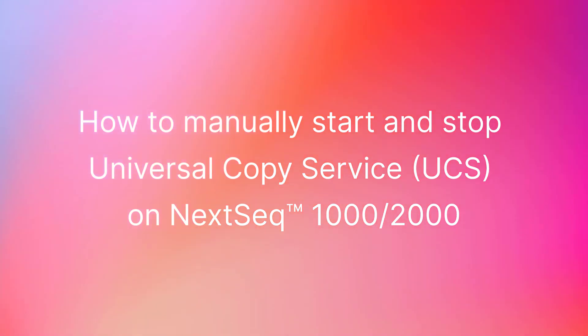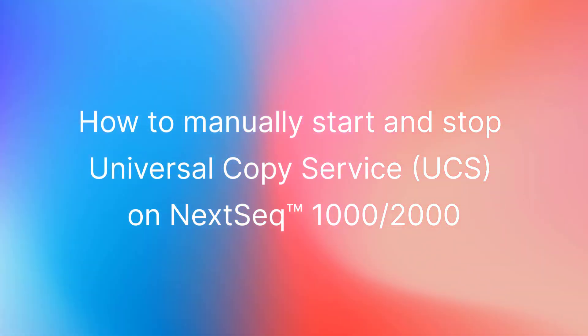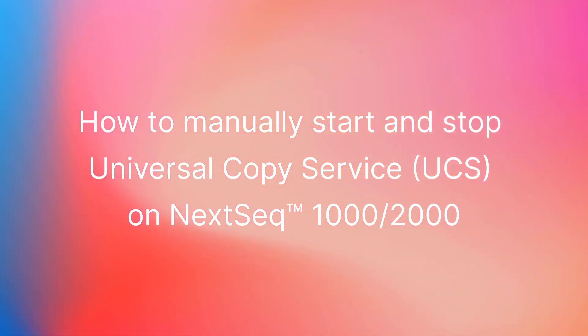This video shows how to manually start and stop Universal Copy Service on the NexSeq 1000 and 2000.